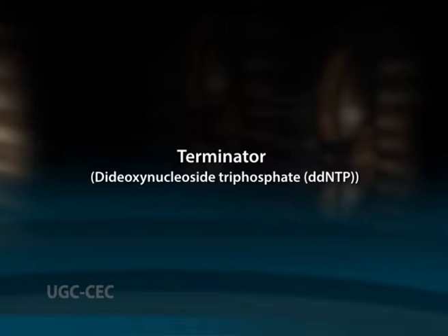into the growing chain. This method was performed in 4 different tubes, each containing the appropriate amount of one of the 4 terminators. All the generated fragments had the same 5' end, whereas the 3' end was determined by the dideoxynucleotide used in the reaction.